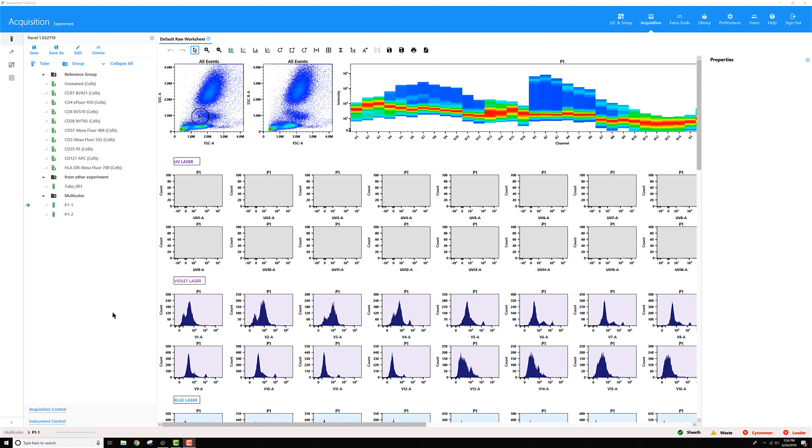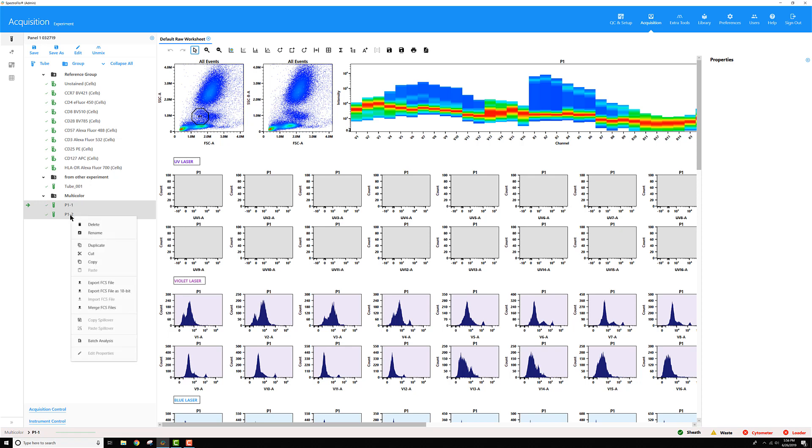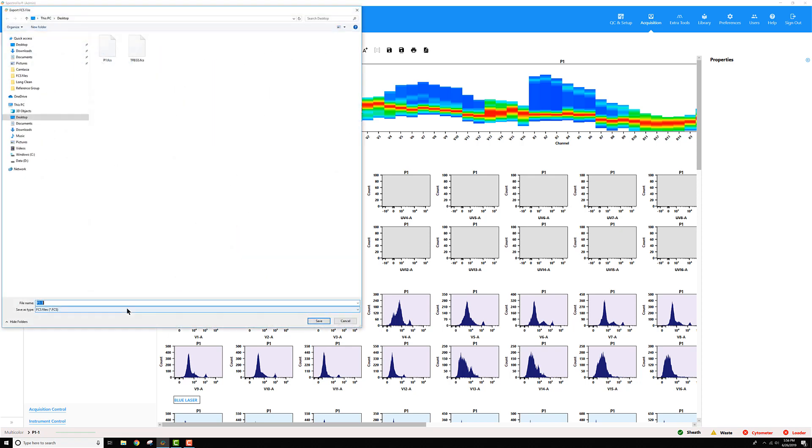Merging multiple FCS files together in SpectraFlow 2.1 is very easy. All you have to do is select the tubes that you want to merge. I'm going to hold Ctrl and select these two multicolored tubes. Right-click, and from the menu that appears, select Merge FCS Files.